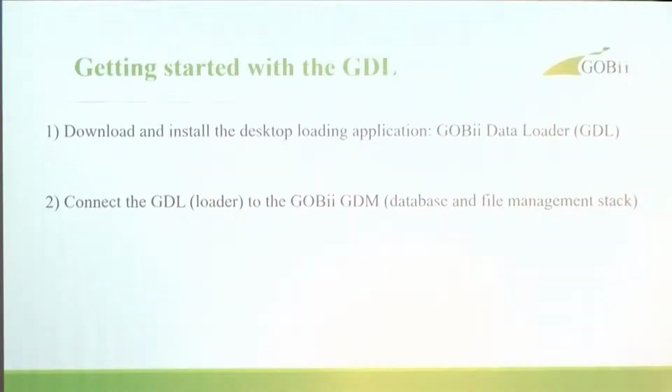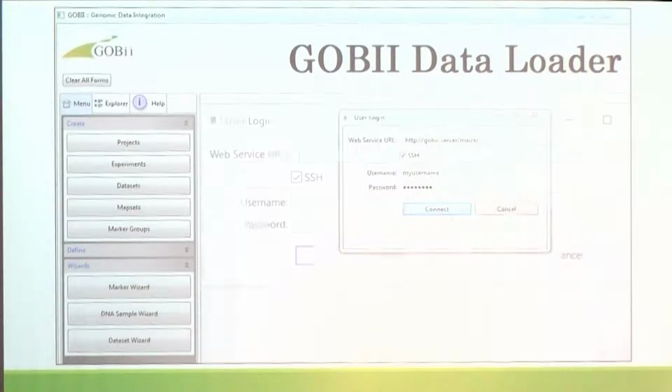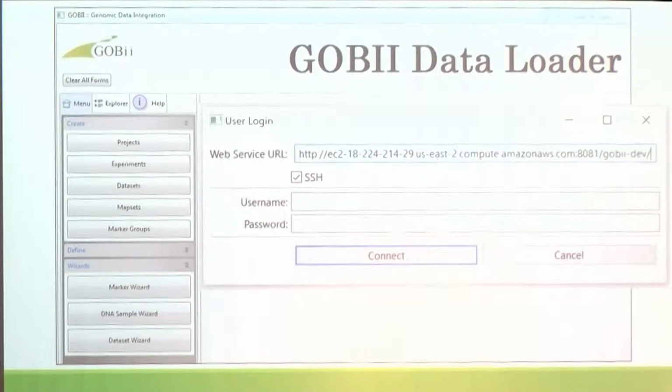So getting started with the GDL. You download and install the desktop loading application and then connect the loader to the database and file management stack. So you log into the loader UI by entering the web service URL, your user and password.